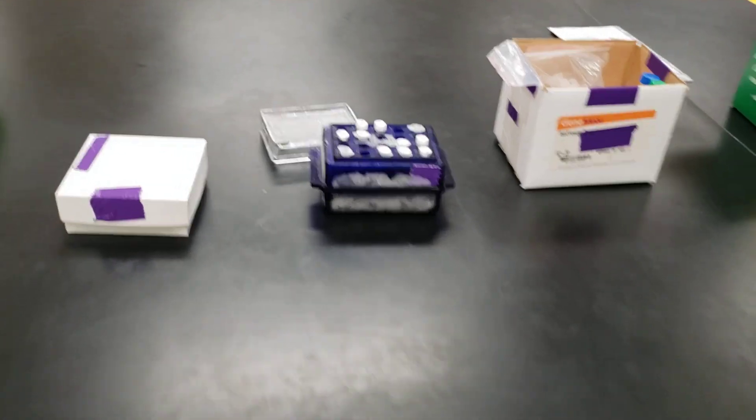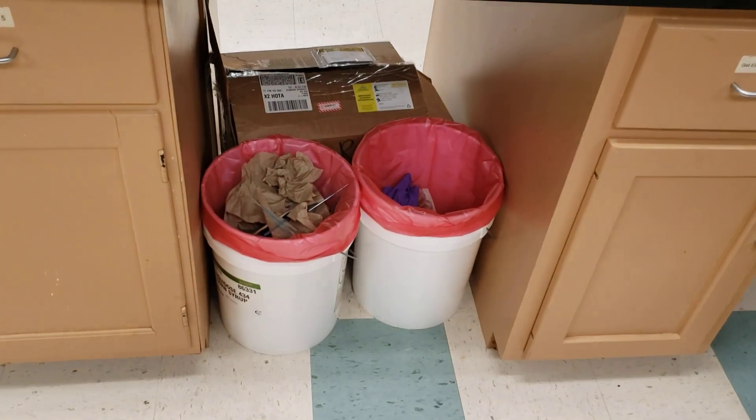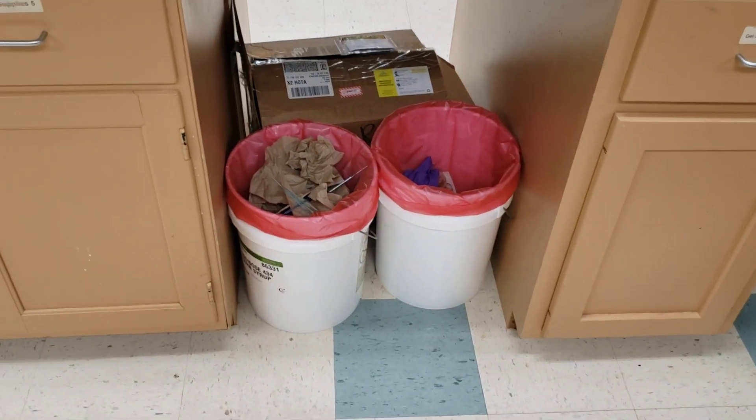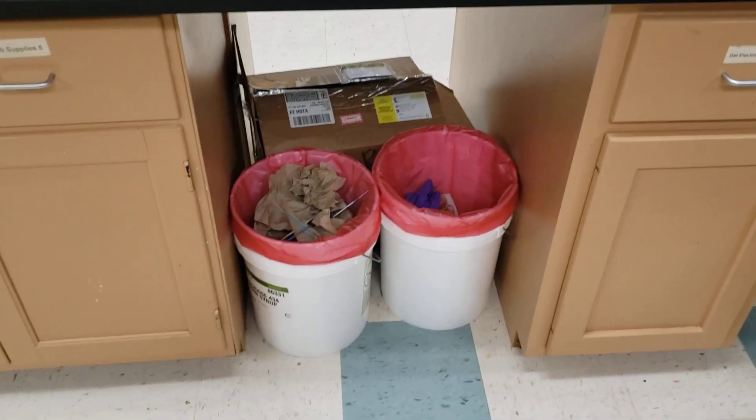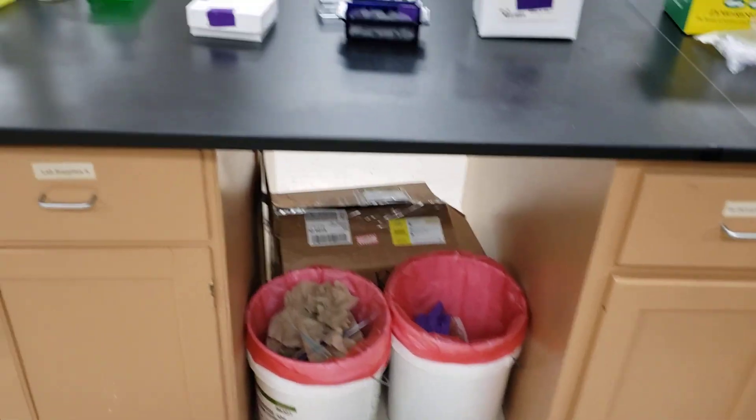Underneath each bench I have five-gallon buckets with autoclave bags so students can dispose of materials. When they begin to get full, my student workers take them and dispose of them properly.